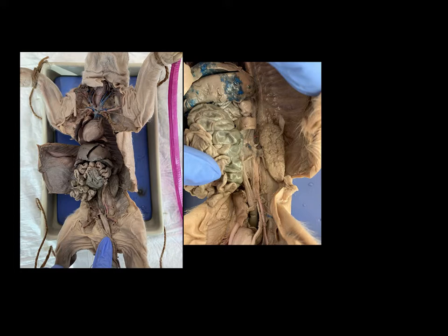But to give you an idea of what we're looking at, this is the left kidney. Now, you don't need to know the kidney on this pig, but it will help you orient yourself. Most of the time when we're talking about kidney, you're going to see the word renal. Renal just means pertaining to the kidney. So this is the left kidney, and there's this blue vessel coming out of the left kidney.